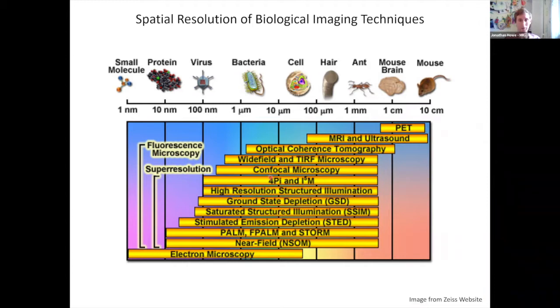The problem with light microscopy is the optical resolution limit, or diffraction limit. This is a hard limit of the achievable resolution, and in order to overcome this, you have to use clever techniques which are collectively called SuperResolution microscopy, and I'm going to discuss some of the principles of these techniques in today's talk. So what is this optical resolution limit and why does it exist?